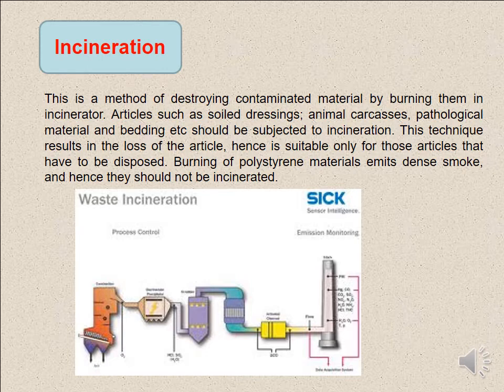Incineration. This is a method of destroying contaminated material by burning it in an incinerator. Articles such as soiled dressings, animal carcasses, pathological material, and bedding should be subjected to incineration. This technique results in loss of articles, hence is suitable only for those articles that have to be disposed of. The burning of polystyrene material emits dense smoke and hence it should not be incinerated.